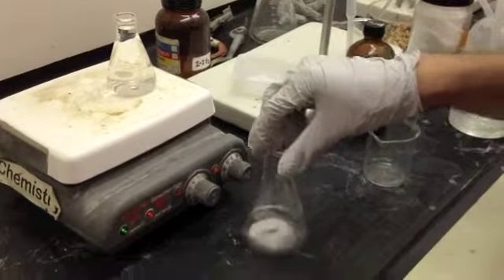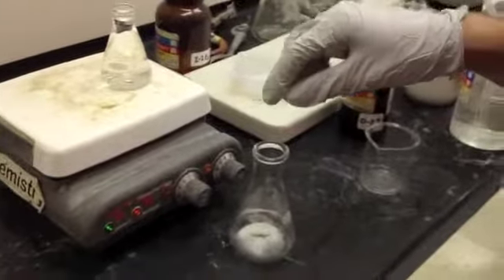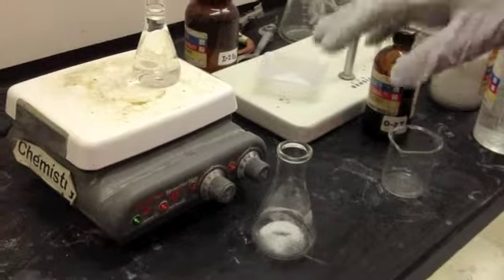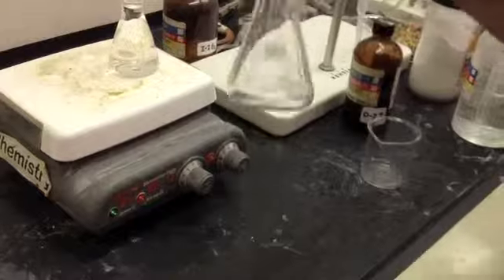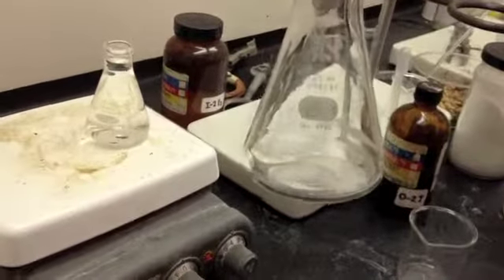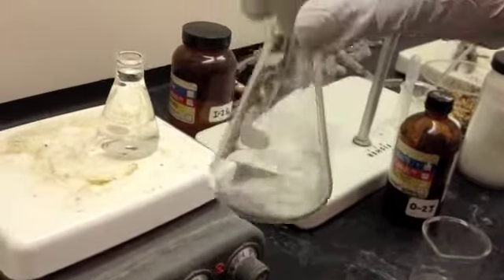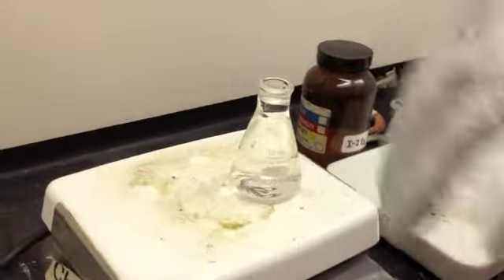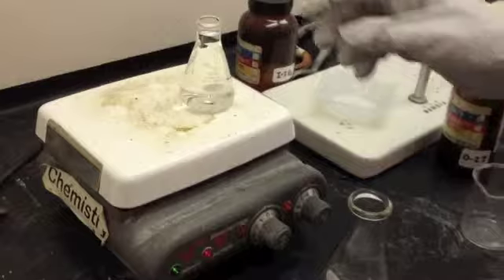Alright, so today we're going to be doing a recrystallization procedure. Recrystallization is used to purify or get rid of any impurities that you have in your compound. Here I have a 125 milliliter Erlenmeyer flask with 1 gram of benzoic acid, and I'm heating up ethanol here on the hot plate because benzoic acid dissolves easily in ethanol.